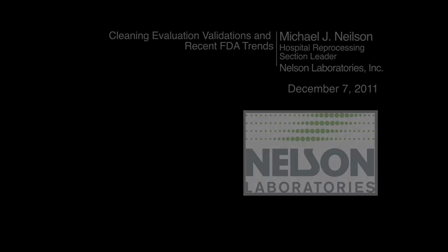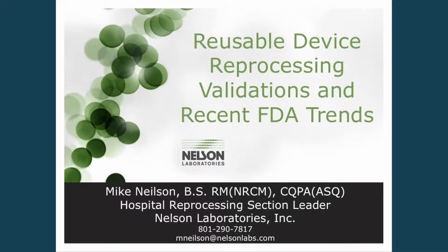We're a contract microbiology testing laboratory, and I'm going to be talking today about reusable medical device validations, reprocessing validations. This is a hot topic right now with the FDA and the reusable medical device industry. So I'm going to be discussing some of the trends that we are seeing right now, and hopefully answer some questions that you may have regarding some of these validations and what we're seeing right now.